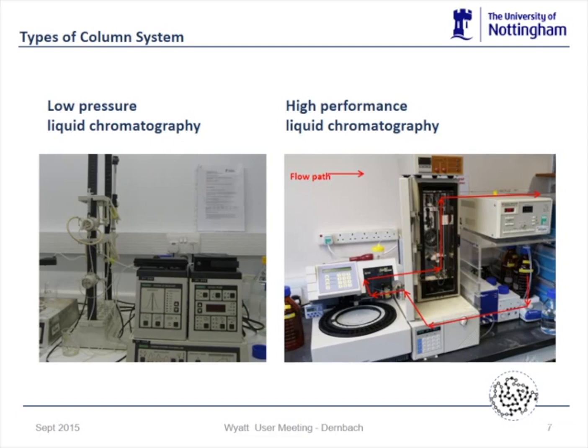When we're working with a high pressure system, slightly more efficient form of chromatography, that's the form of the column that we're using. Okay, much smaller particles, much higher pressure. And what we tend to do, if you actually have a look at our working system, rather than just have a single analytical column, we have firstly a guard column, which stops any contaminants going into our analytical columns.